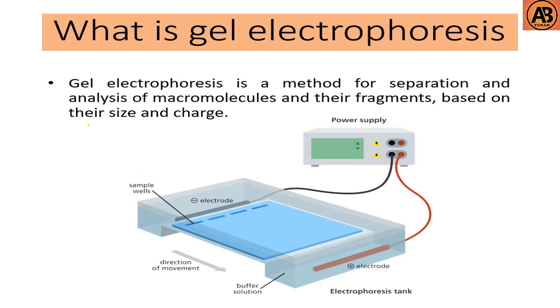In this video we're going to learn about gel electrophoresis. So what is gel electrophoresis? Gel electrophoresis is a method for separation and analysis of macromolecules and their fragments based on their size and charges.